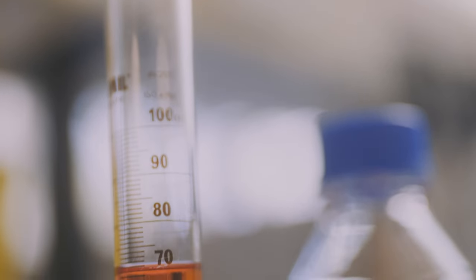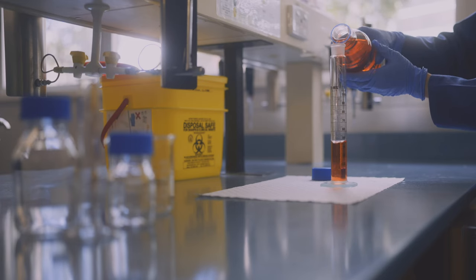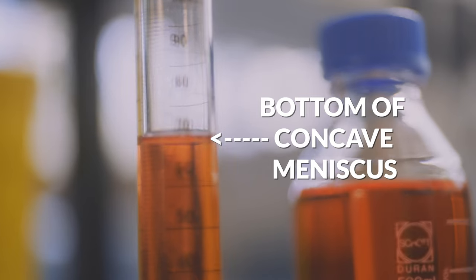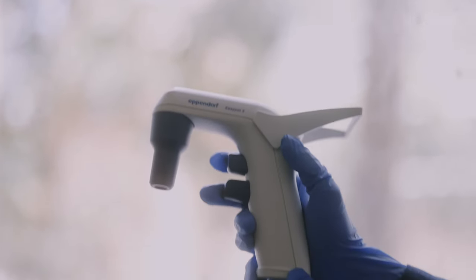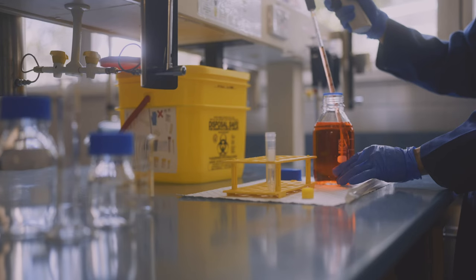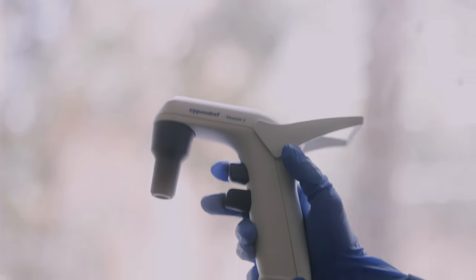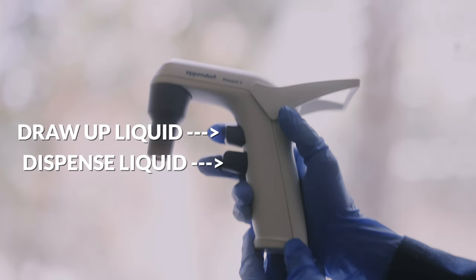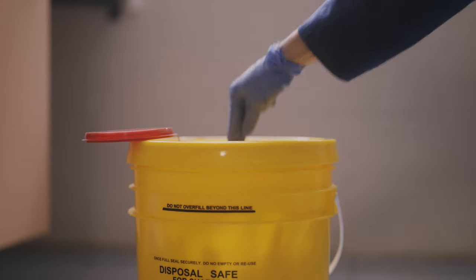How do we work with volumes of liquid more than 1 milliliter? Buffers and nutrient media are often hundreds of milliliters. We can pour the liquid into measuring cylinders and use the bottom of the curve of the concave meniscus to gauge the volume. Motorized pipette controllers with specialized single-use pre-wrapped pipette tips can dispense 5, 10, or 25 mils in a more accurate and reproducible way. On the pipette controllers, there's usually one button to draw up liquid and one button to dispense liquid. After you're done, make sure the long pipette tips are disposed of in the right bin.